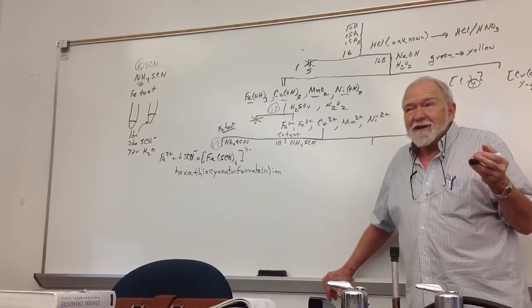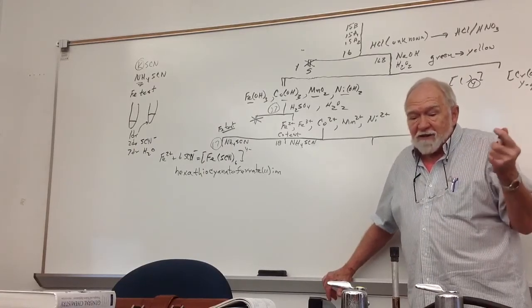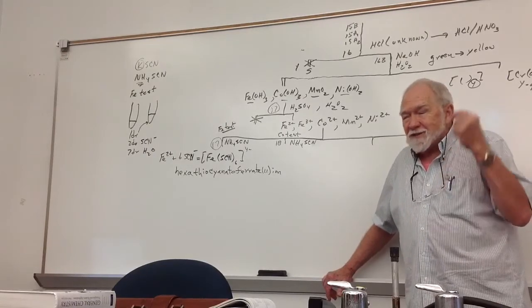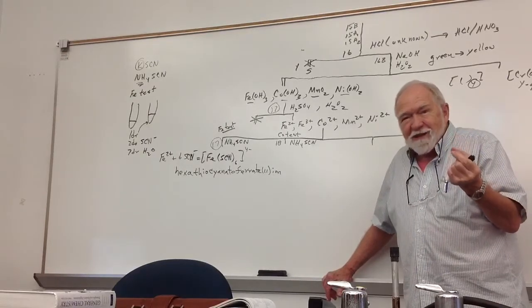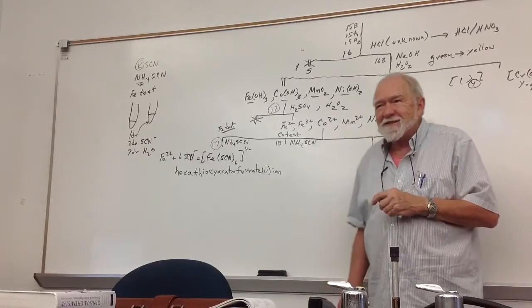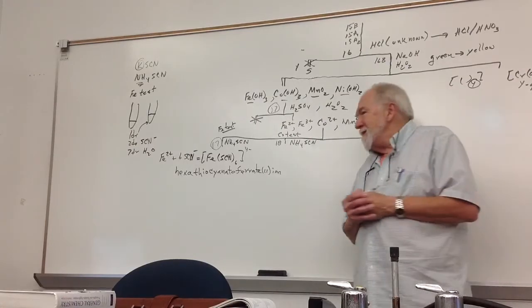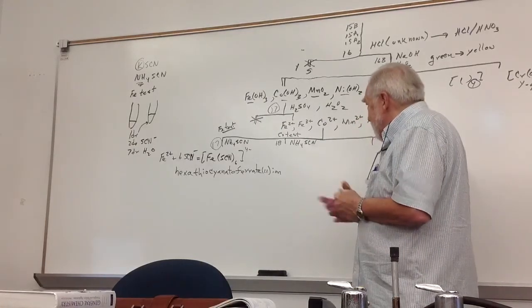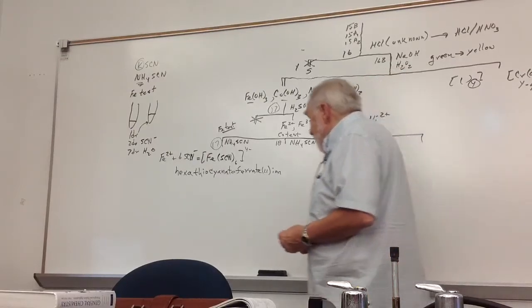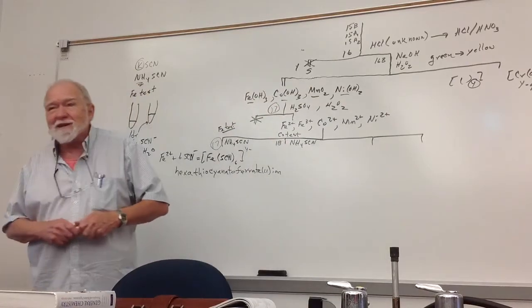Okay, so those are the things you want to think about. I don't tell you how many because each sample does have different numbers of ions. But none of them are going to have less than 1, and none of them are going to have more than 8 in experiment 2. Because 8 is the maximum number I can put in there. That's all the ions there are. So same thing here. You're going to have some ions. And the most logical thing is I say I'm going to be halfway between the maximum and the minimum.